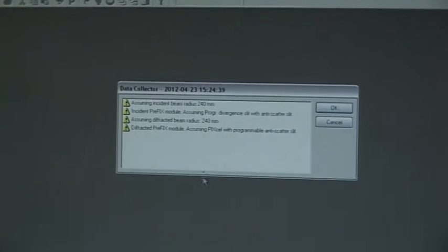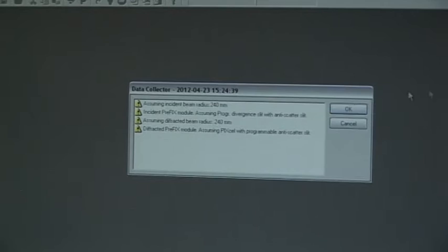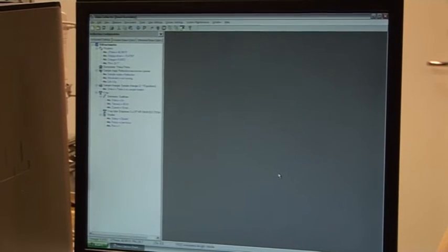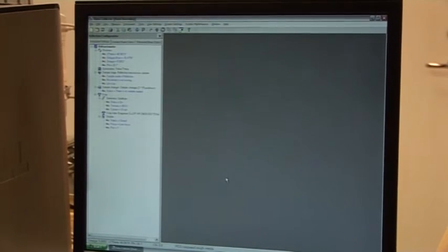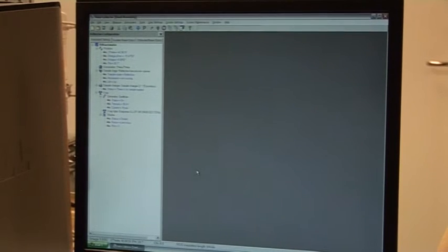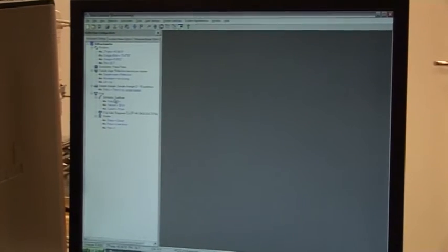So now it's connecting, and then you usually get some warnings. The warnings are settings that machine thinks we have. Then I just click OK. Sometimes it tries to check the safety for the sample changer.